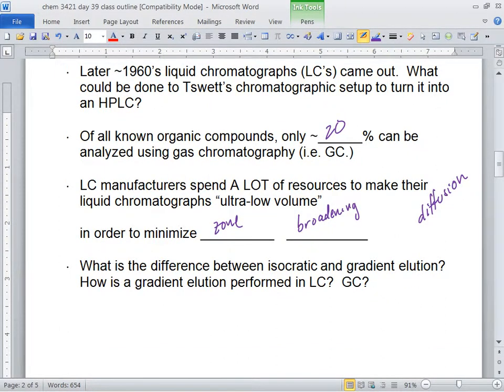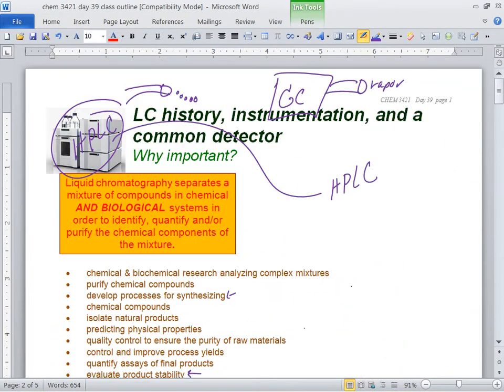But it's a big deal because that's the chromatography. Chromatography, thinking of it in terms of a verb. How do you do chromatography? We're going to do chromatography. Well, you do it by doing these gradient elutions. Okay, great. Well, what can you change in liquid chromatography? The solvents, which aren't pictured in this black box. Oh yeah, they are. Here's our solvents.